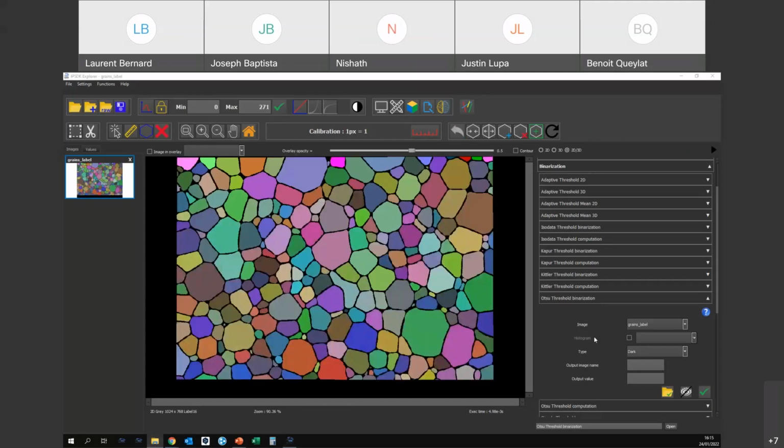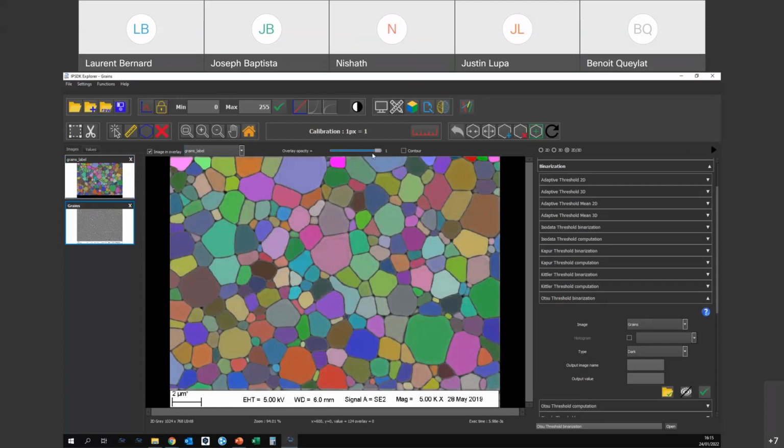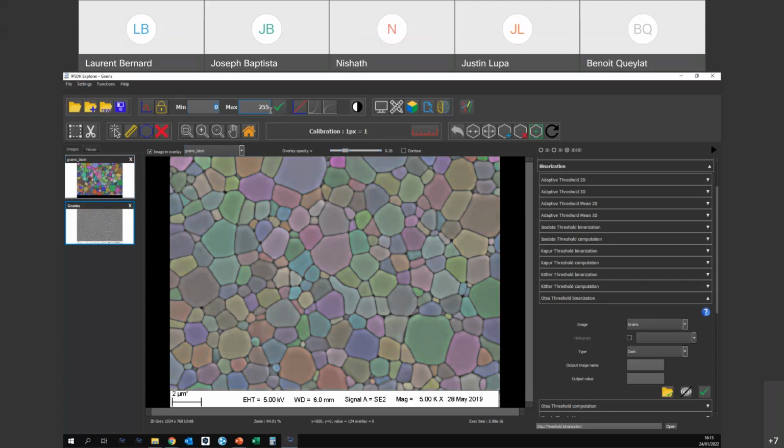Other thing that we have, let me just show you here. So you can get an image, and you can put in this image an overlay. You can play with a display, and you could also imagine, let's say I want to change my display context. Okay, but this is still the same image. Nothing has been grabbed, and it was complex to save it.